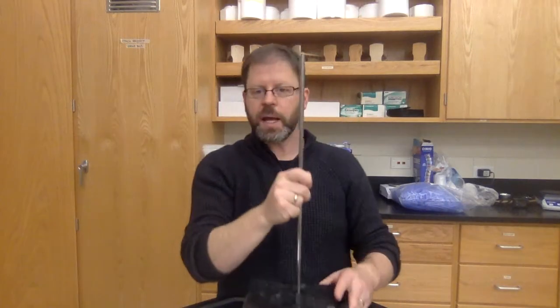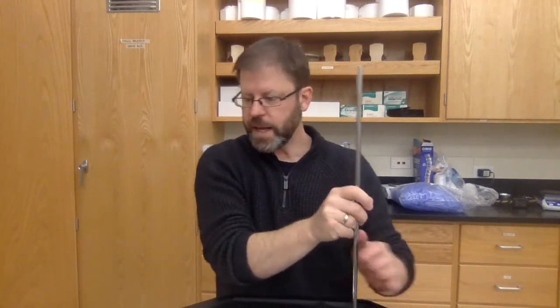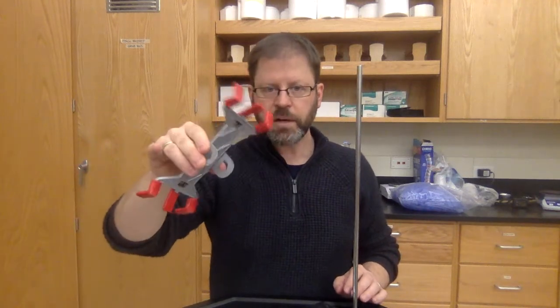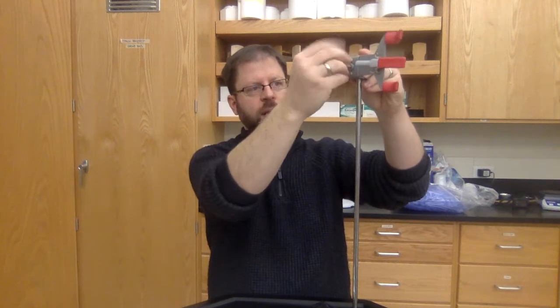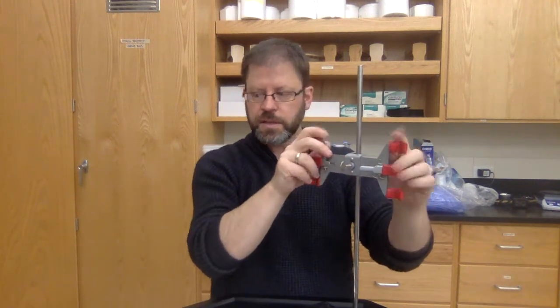So here's my ring stand, and then this is a burette clamp. The middle part of the burette clamp goes down. There's this little nut thing here so that I can tighten it. So I tighten that in. Okay, so it's good and steady and firm.